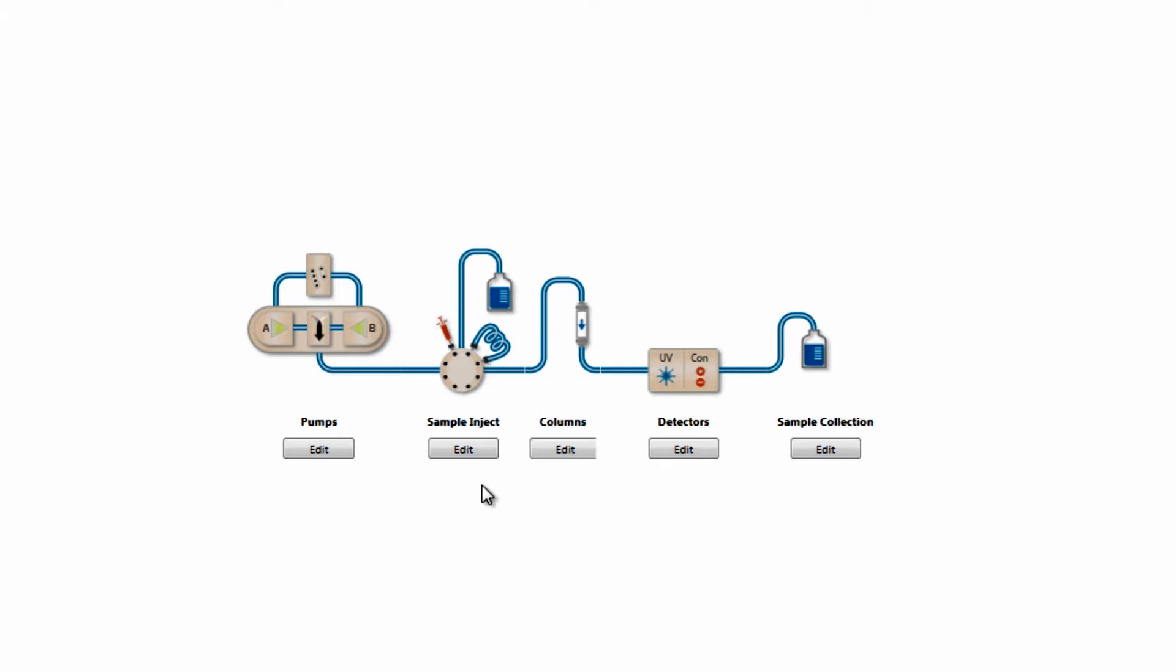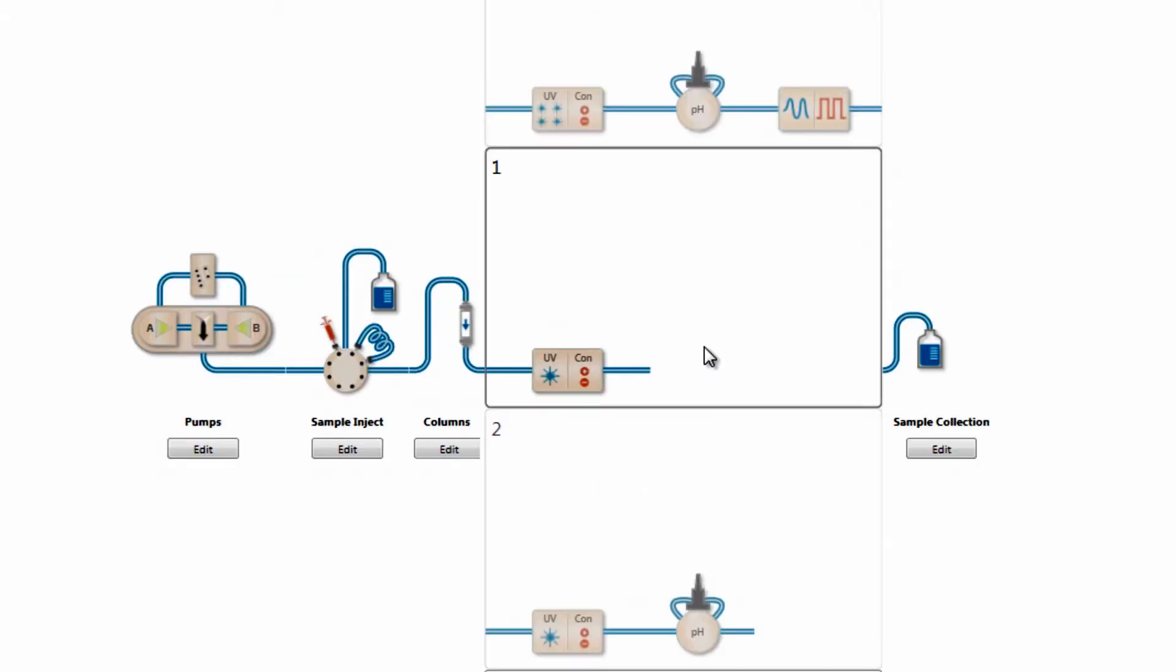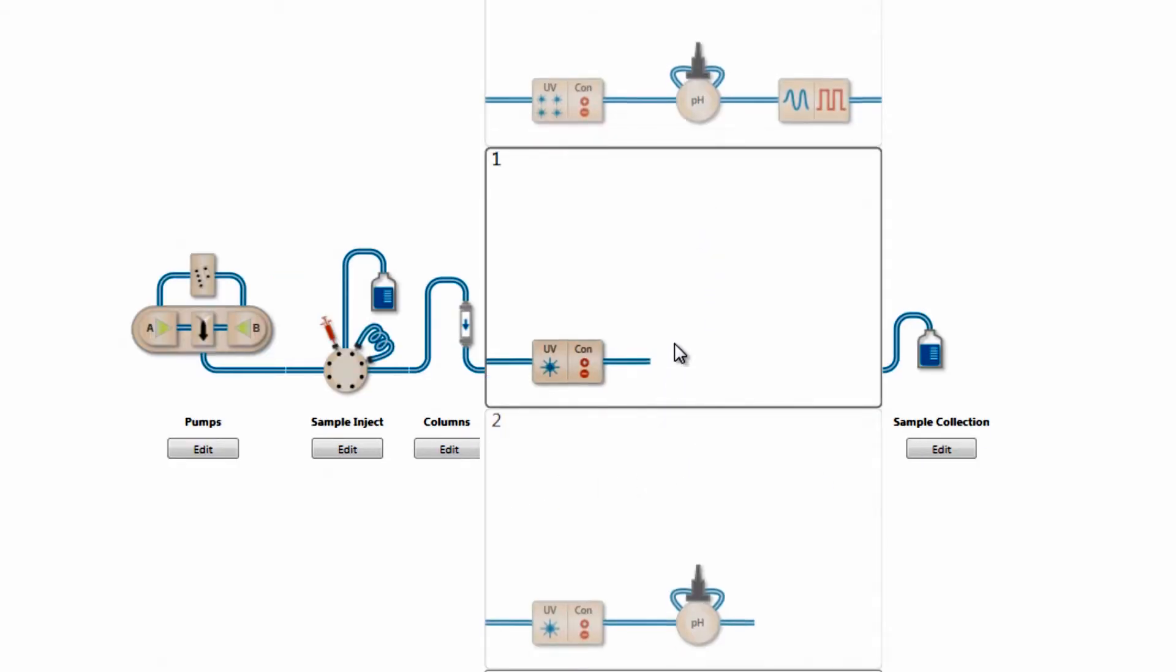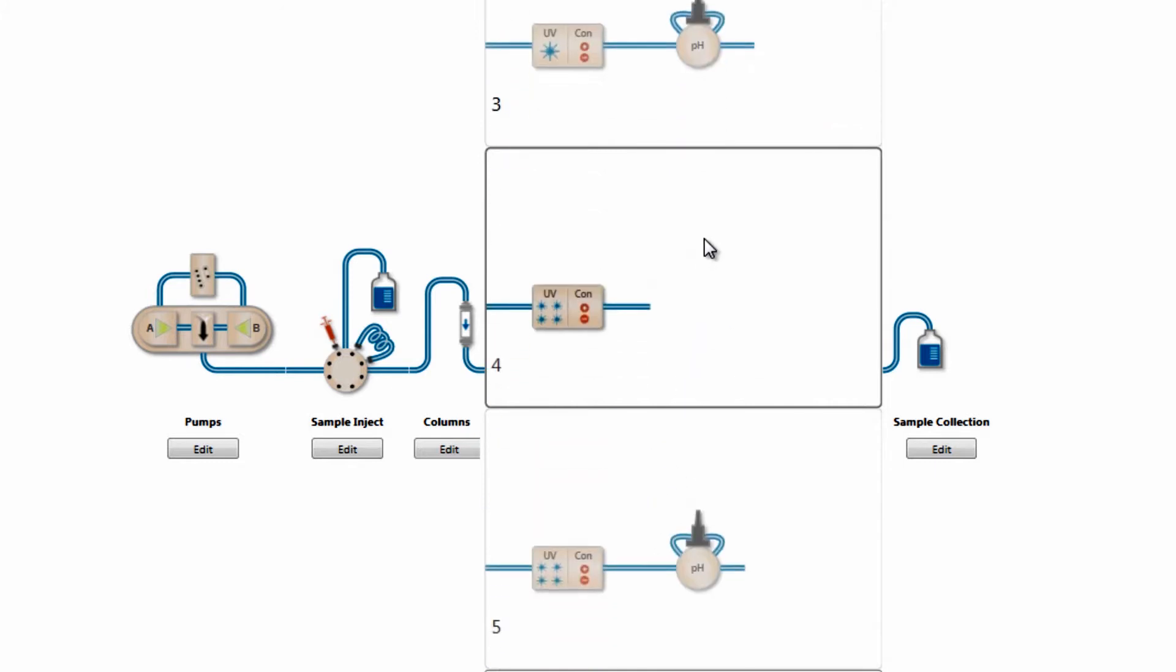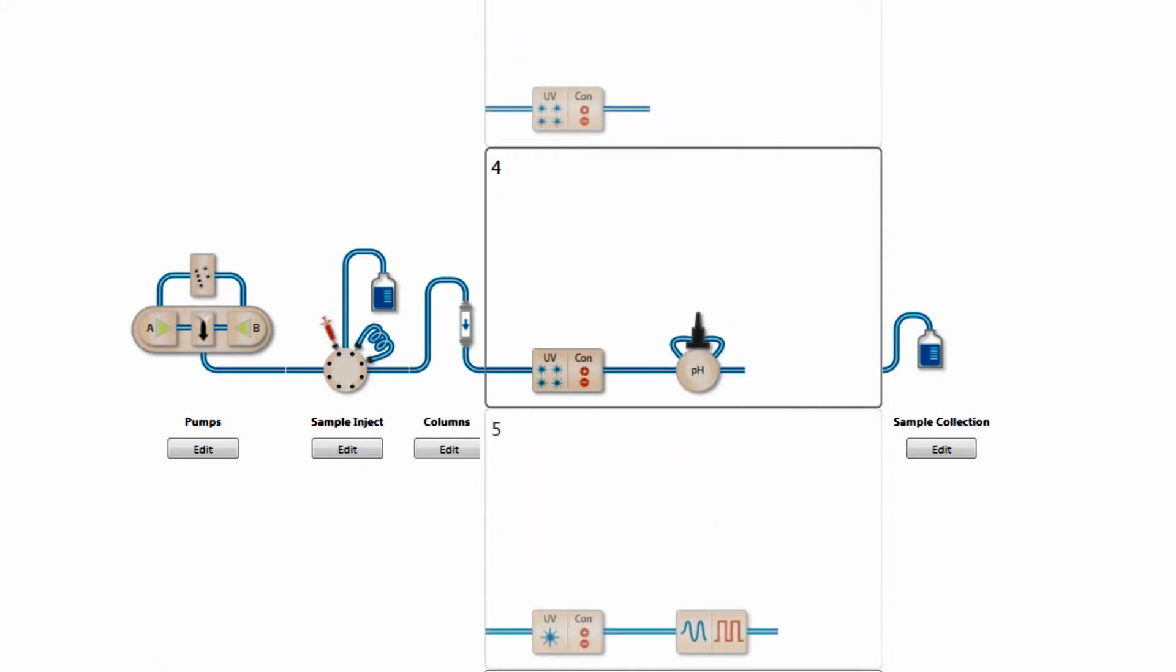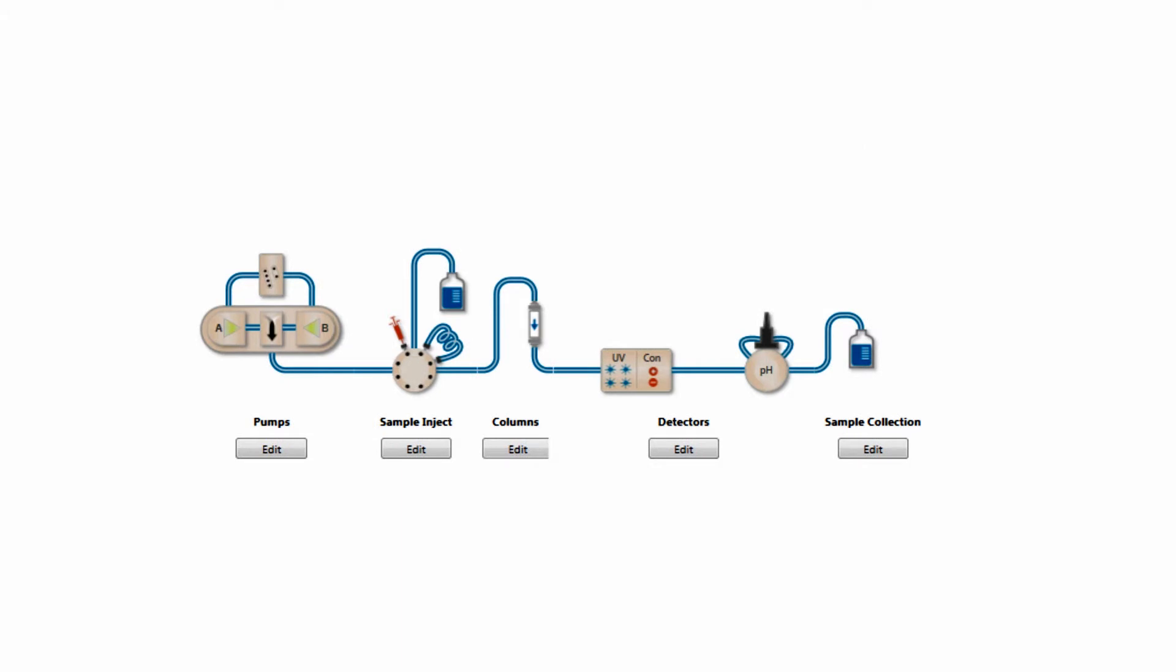In the flow path, the NGC-PH valve is placed after the UV detector and conductivity monitor, and also the back pressure regulator if it is present. The pH valve is always the last device in line.